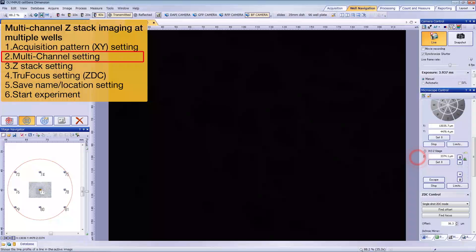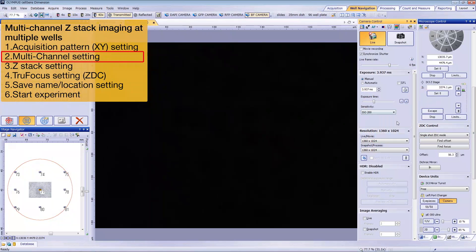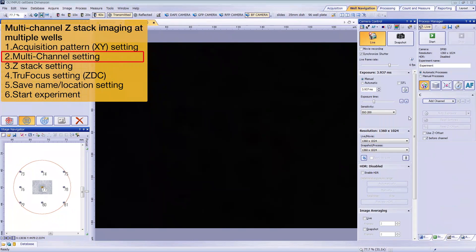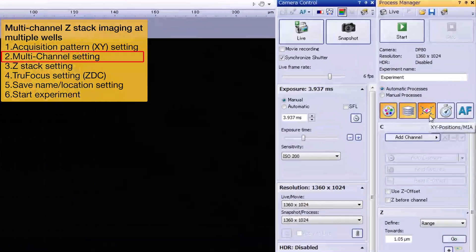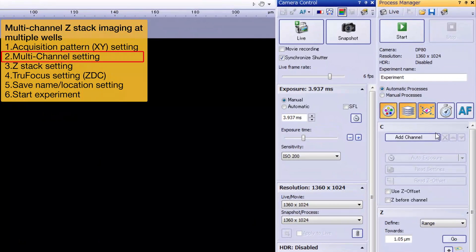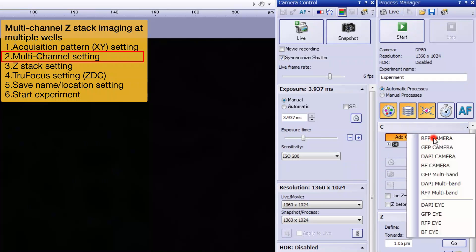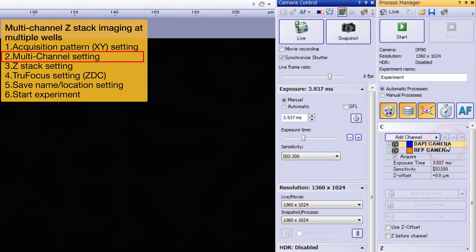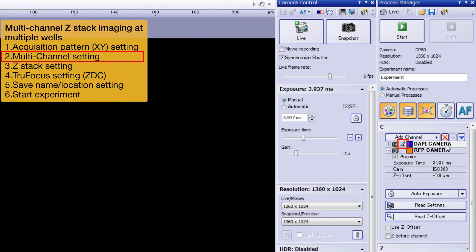Now we'll enter the acquisition settings. Open the Process Manager tool window. Click the Multi-Channel, Z-Stack, and XY Positions MIA icons to enable them. Time-lapse is also available, but we'll skip it here to save time. Assign DAPI and RFP channels. Click on the DAPI channel. The microscope icon indicates that your system is ready to acquire DAPI.